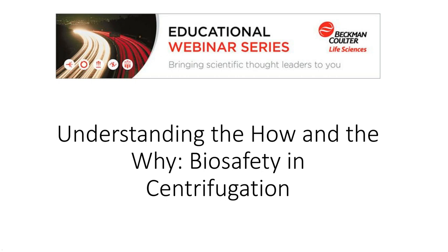Next question. Is there somewhere that I can find information on chemical compatibility and O-rings?